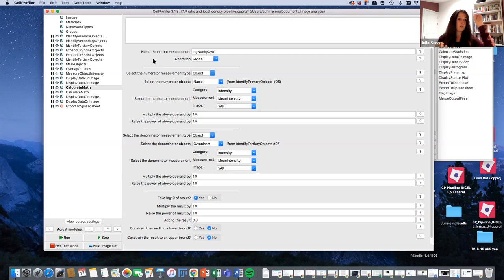Okay, so those are equivalent to one another, right? Three total molecules, two of them are here, one of them is here, or two of them are here, one of them is here. But the difference between 1 and 2, obviously, is 1. And the difference between 1 and 0.5 is 0.5. And then let's double that. So going further, a 4:1 ratio, 4 in the nucleus, 1 in the cytoplasm. Obviously, that number is 4. What's the inverse of that? In fact, the inverse of that is 1:4. Okay, fine, that's 0.25.